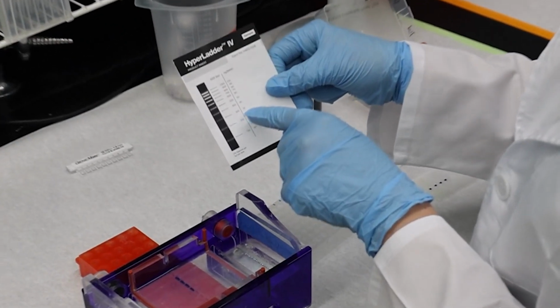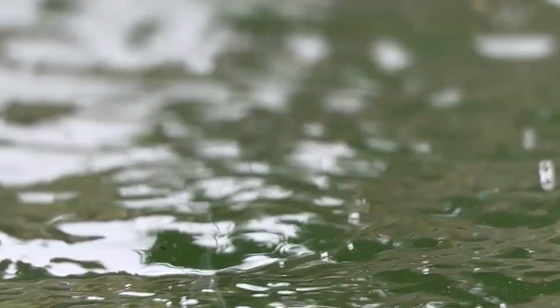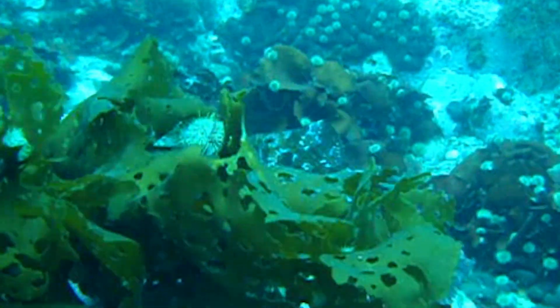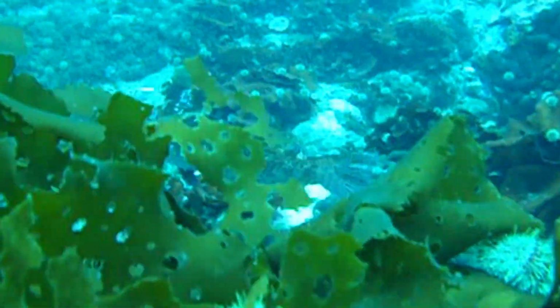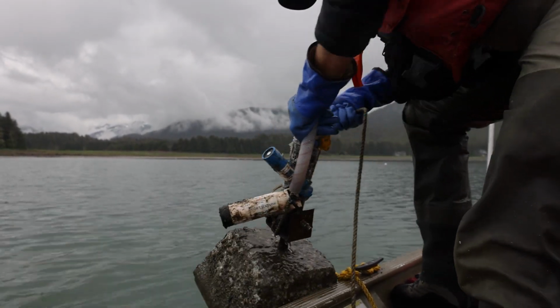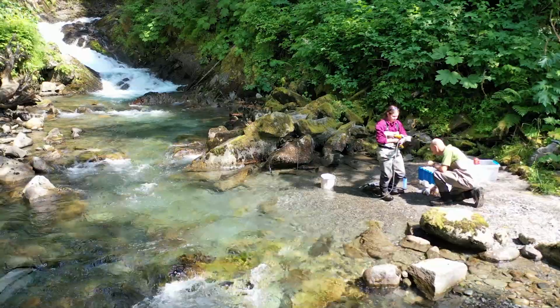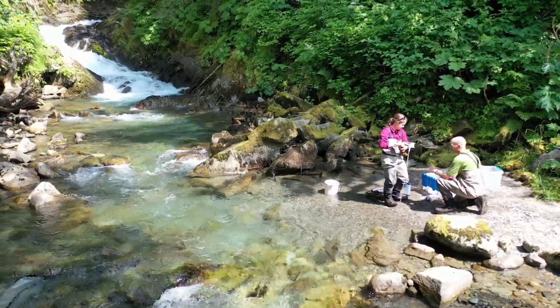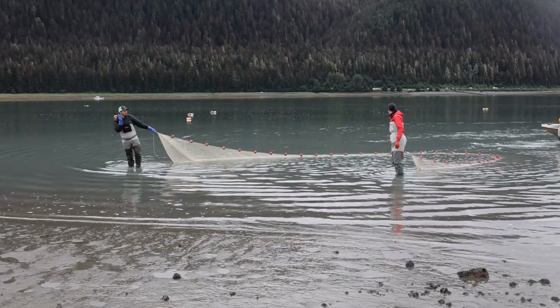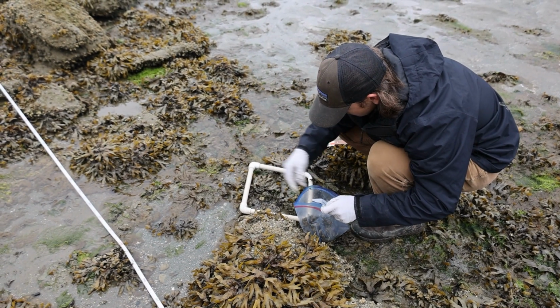We decided to use eDNA to try and answer our research questions because eDNA will capture anything and everything that is in the environment. We have to figure out if it's also an accurate way for us to collect our samples. So one of the things we're doing is comparing our eDNA samples to other conventional sampling methods that we've been using, such as beach seining for fish and percent cover in intertidal areas.